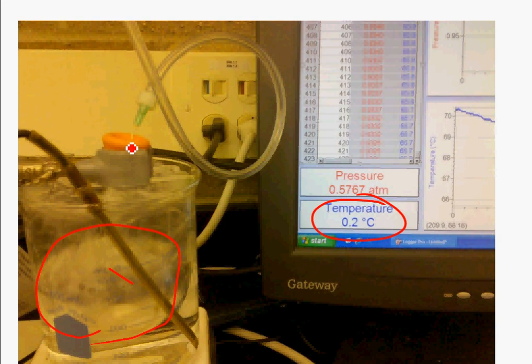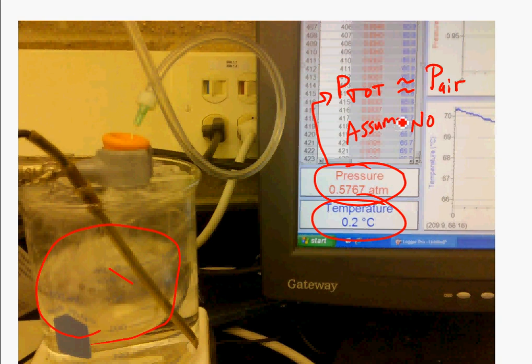And so now we still have our pressure sensor. We never disconnected anything. So now the pressure that we read here, which again is the total pressure, we are going to assume is equal to only the pressure of the air that was in that flask while we were doing that experiment. We are assuming that there is no pressure coming from the water gas at this temperature. And we're going to need that to do our calculations, which again I will explain when we are in lab. But there is the experiment.